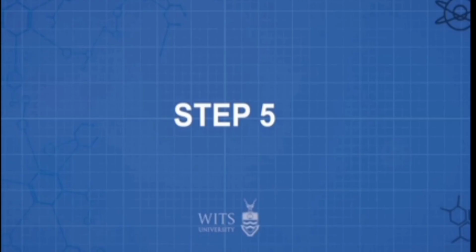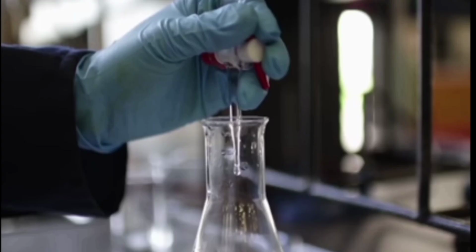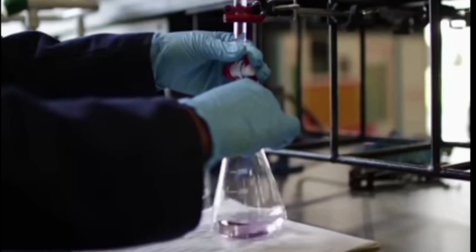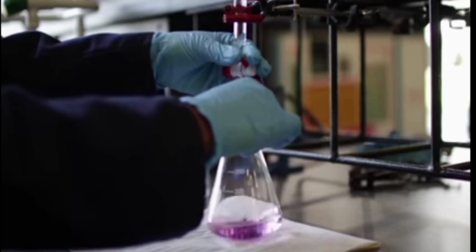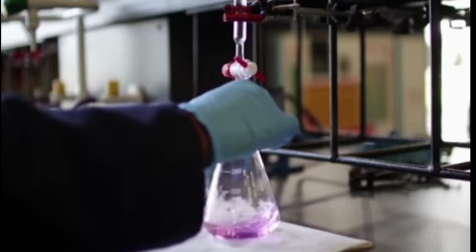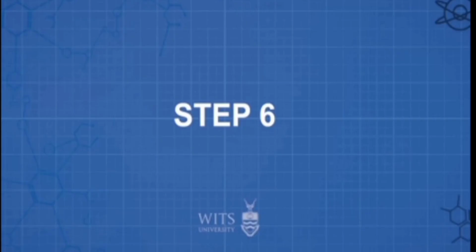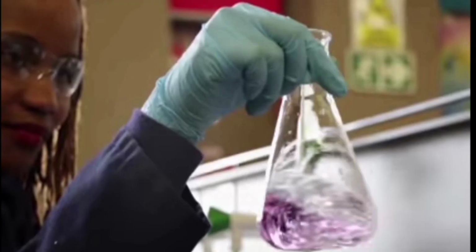Step 5. The solution from the burette is run into the conical flask. The solution is added 1 drop at a time and swirled to mix as the endpoint is approached. Eventually, a color change shows the correct amount that has been added to react completely with the analyzed chemical in the sample. Step 6. The volume of solution added from the burette is noted. The titration results can then be used to calculate concentration.